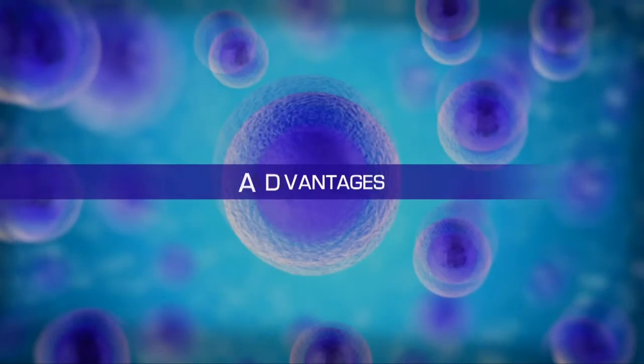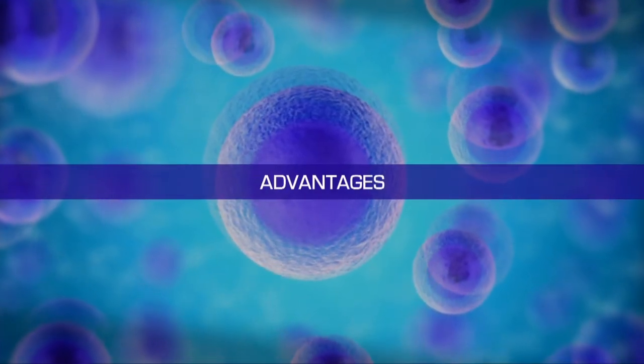There are certain advantages of using trypan blue. Trypan blue dye exclusion assay is a relatively simple, inexpensive, and rapid method for determining cell viability in cultured cells.